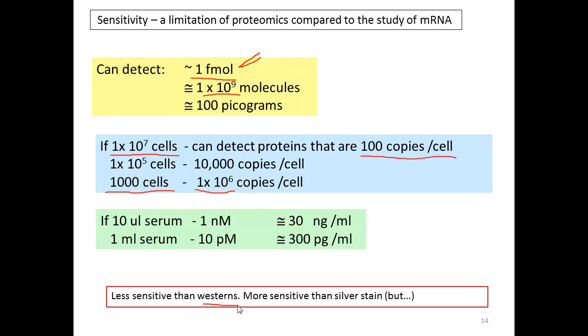So definitely people would like to develop new technologies that were capable of assessing thousands of proteins on small samples with only 1,000 cells. Again, we're able to do that at the mRNA level because we can take the mRNAs from 1,000 cells, amplify them using RT-PCR or other methods, and then put them on a chip or sequence them using next generation sequencing.